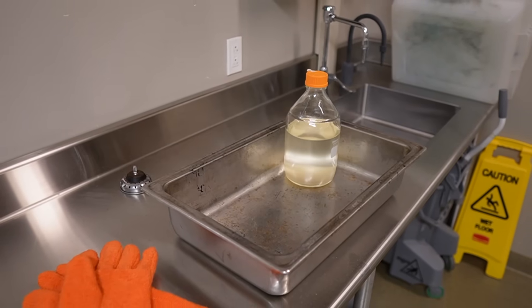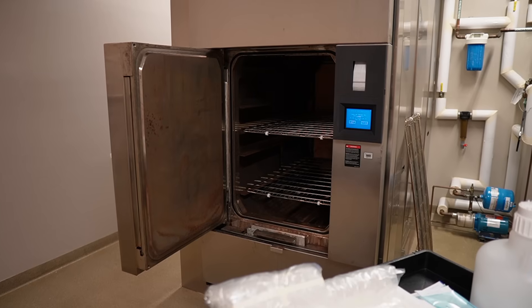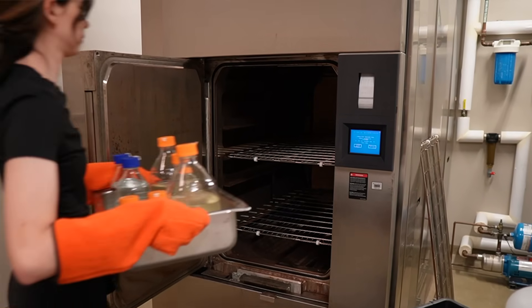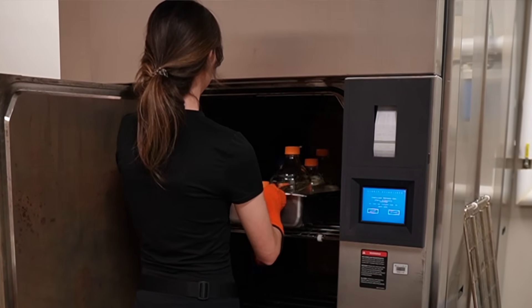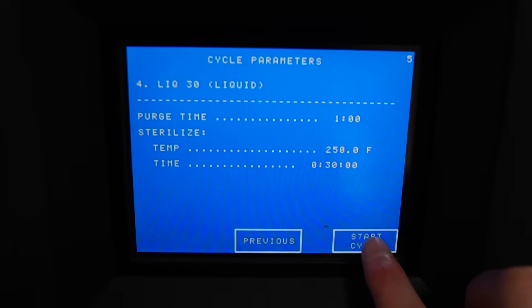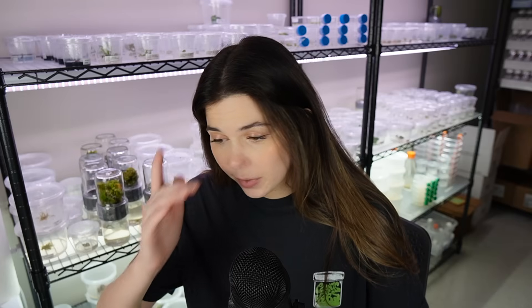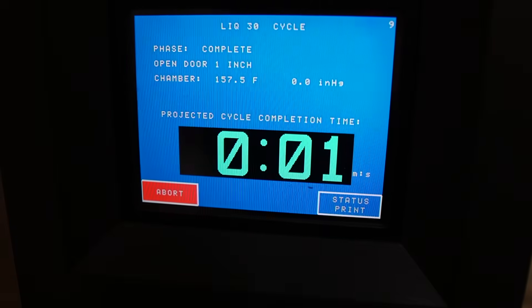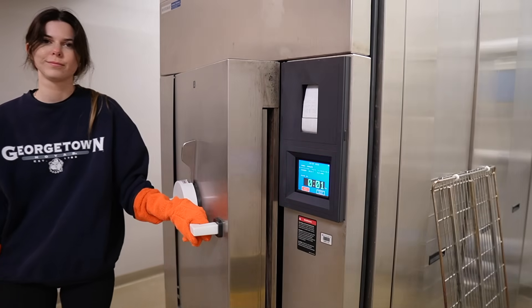You want to leave the lid of the media bottles a little bit loose so that they aren't going to explode under pressure. I put the media bottles in a secondary containment tray just in case. I like to run them on the shortest cycle, which is liquid 30. Autoclaves have multiple types of cycles — gravity, which is more for tools and equipment, and liquid cycles. Although it's called liquid 30, the cycle actually takes pretty much a whole hour. After it's done, I remove the media and the containers from the autoclave wearing special gauntlet gloves since everything is really hot.